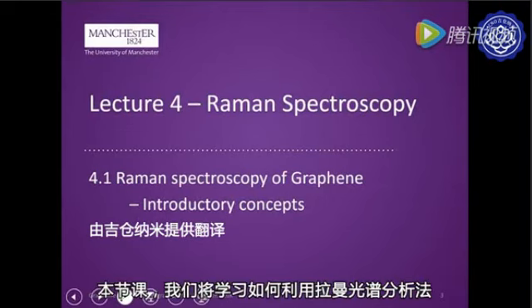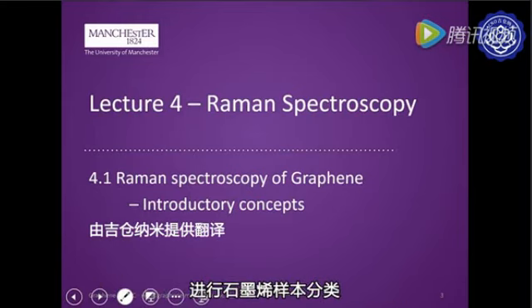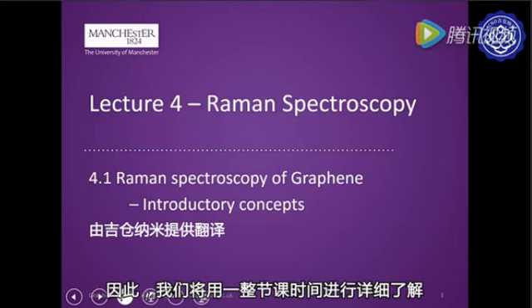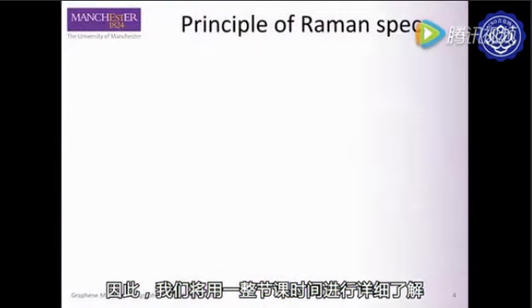In this lecture, we will learn about how Raman spectroscopy can be used to characterize graphene samples. Raman spectroscopy is perhaps the most powerful technique available for the characterization of graphene and other two-dimensional materials, and therefore we will dedicate this entire lecture to the study of this technique.